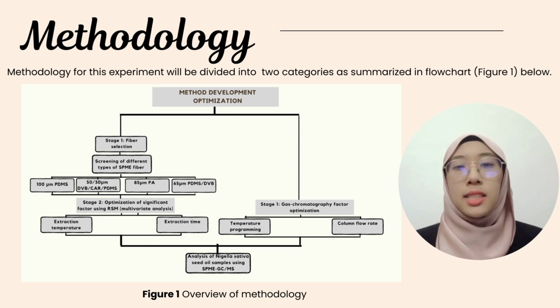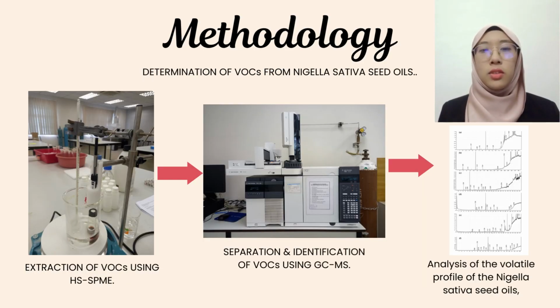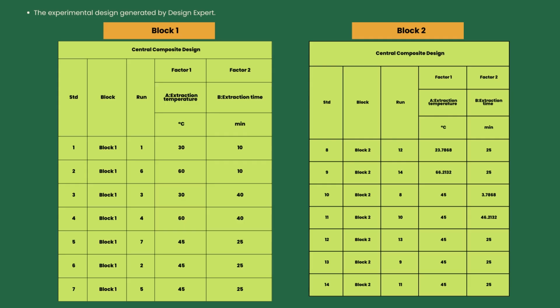The second stage is the optimization of the significant factors, which are extraction temperature and time, using RSM. This continues with analysis of the Nigella Sativa seed oil sample using GC-MS and SPME. Here is the method in determination of VOCs from the Nigella Sativa seed oils.